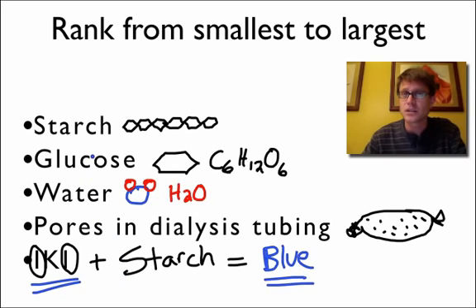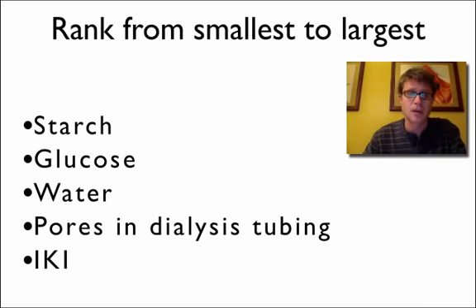And so after you watch this demo, what you want to be able to do is rank the following: starch, glucose, water, pores in the dialysis tubing, and then finally IKI. You want to be able to rank all of those from the smallest to the biggest.